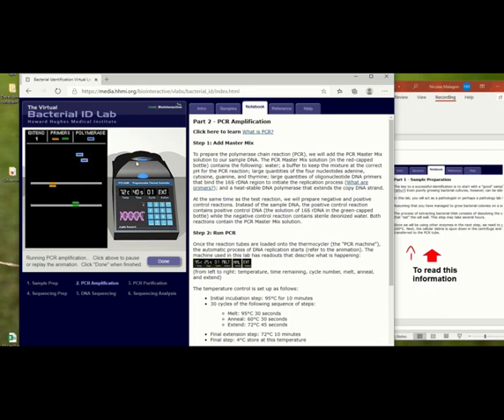That is using the complementarity of the bases, is allowing the DNA to be copied, and we are making photocopies of the DNA to be able to have extra copies. So when we have all these photocopies of the DNA, we get amplified all this sequence, we can easily identify the DNA, because instead of having a very small amount, now we have a lot of those copies, and we can sequence it much easier in that way.